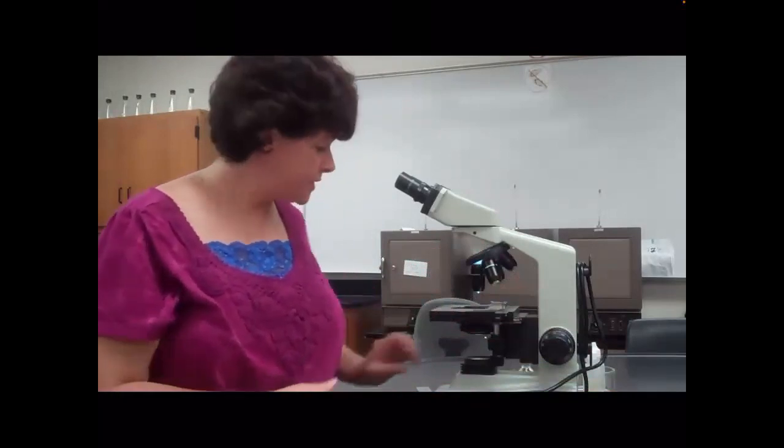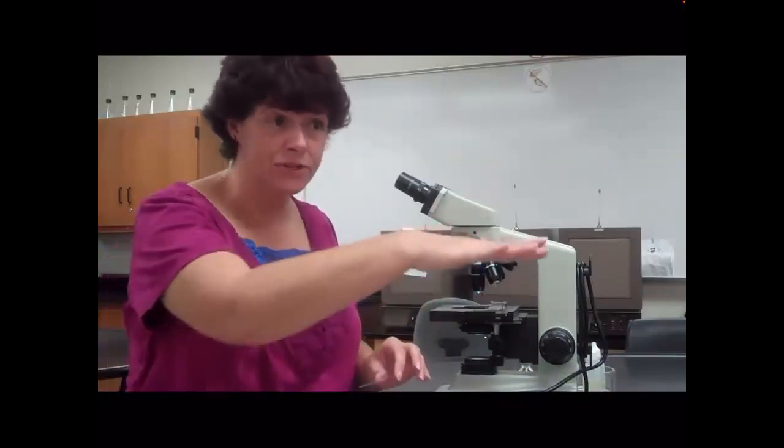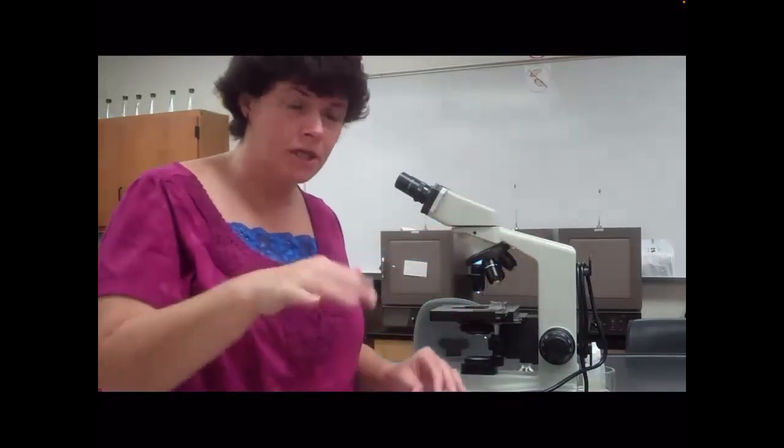Now you're done looking at your specimen. Make sure that you keep your slides for just a minute. Talk to your lab partners before you throw them out, because if their stain didn't work, they can use yours, okay? So keep them for a minute, talk to your lab partners, especially if you have a really good one, you want to share it with the class.